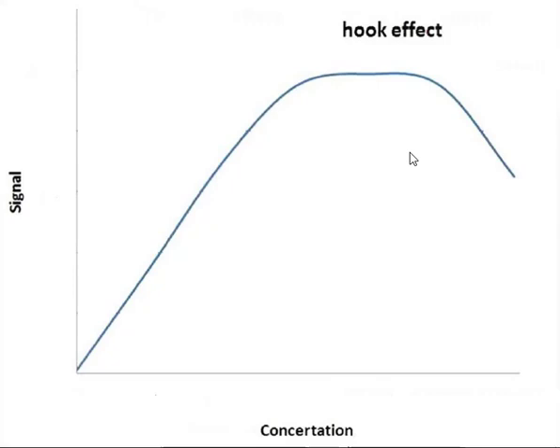Besides, here there is an excessive amount of analyte. This excessive antigen concentration will saturate binding sites of capture antibody. As you see here, the binding sites are saturated by the analyte, and so we still have some free analyte in the reaction environment, which in turn binds to the detector antibodies, and as a result there isn't enough detector antibody to bind to our complex on the surface of the plate. I mean the complex of a capture antibody and the analyte. Till now it was the first step of the reaction on the microtiter plate surface.